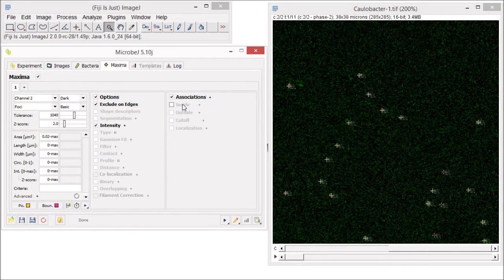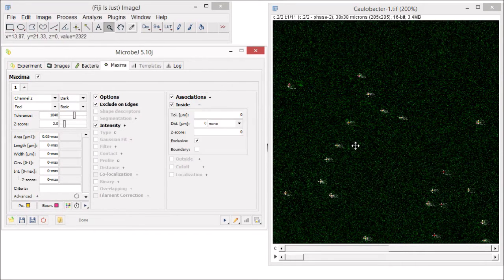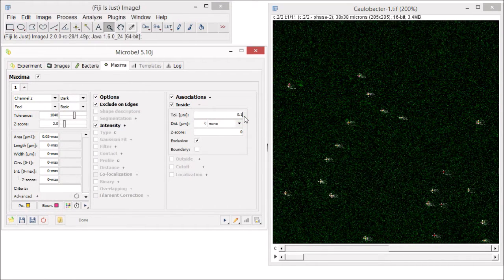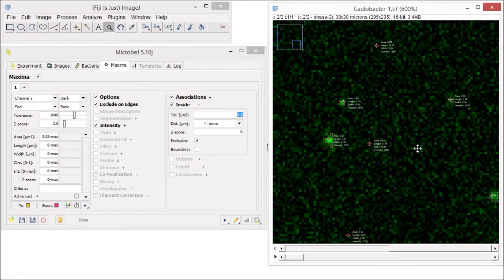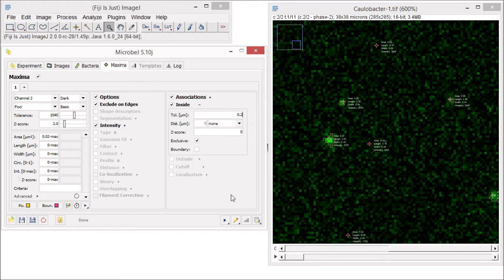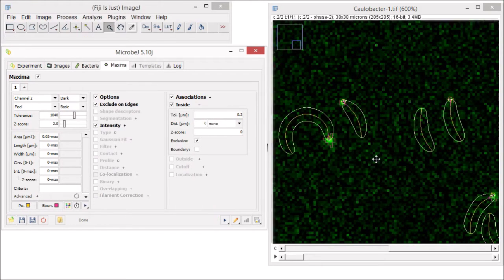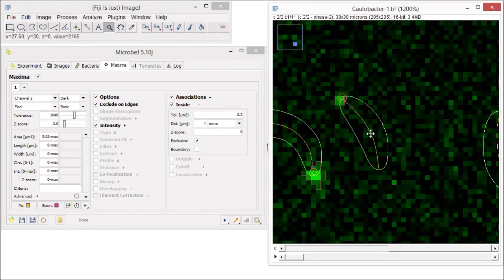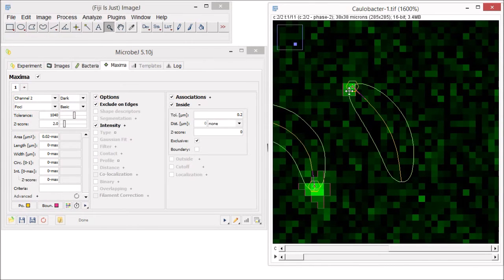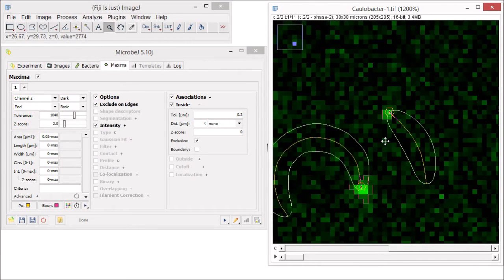If you know that the maxima should be within a defined boundary of your cell, check the inside mode. Sometimes the maxima might be slightly outside the detected boundary of the bacterial cell, so I would recommend defining a tolerance, something like 0.2 microns, and then press the main test button. Notice that when maxima are associated with bacteria, the boundary around the maxima changes to a hexagon and stick.